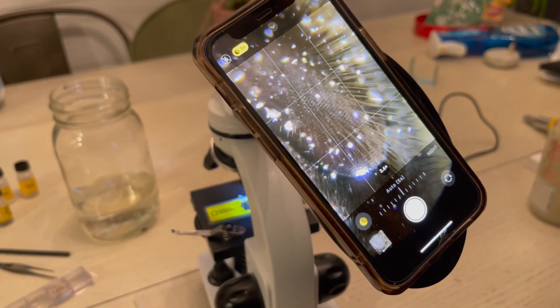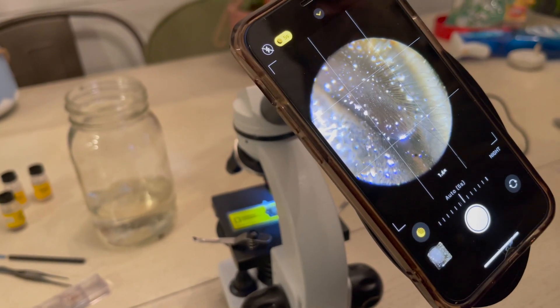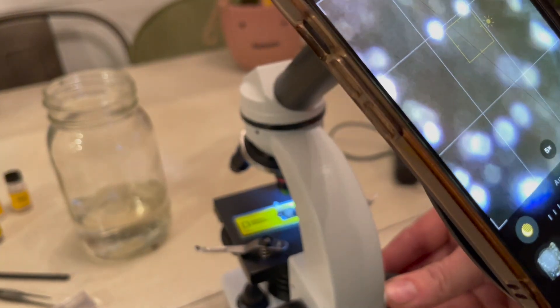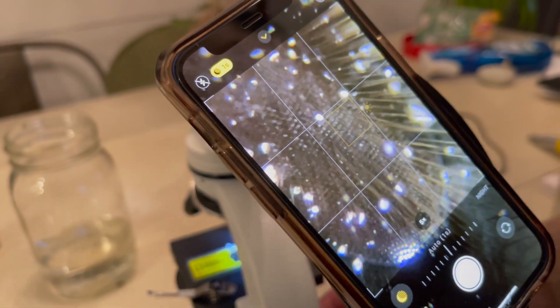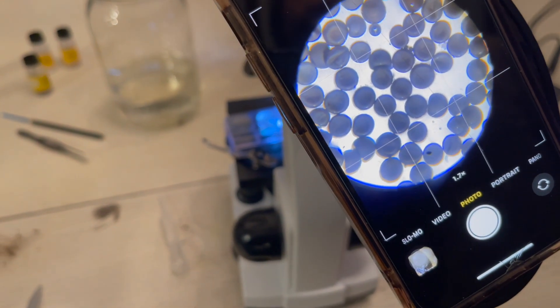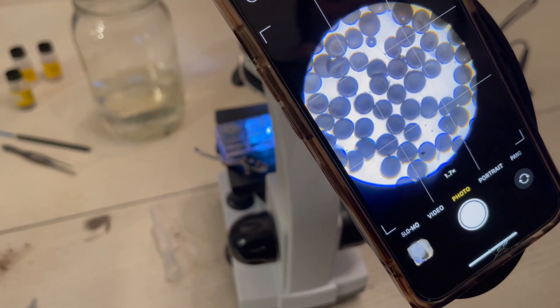We've looked at everything from feathers to dirt in the yard, pond water, brine shrimp eggs, and the honeybee — everything has been really interesting. When you're finished viewing samples you can pack everything back up in the included carrying case and take it with you wherever you go.